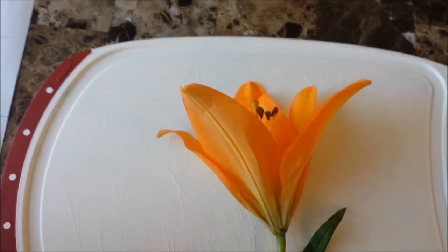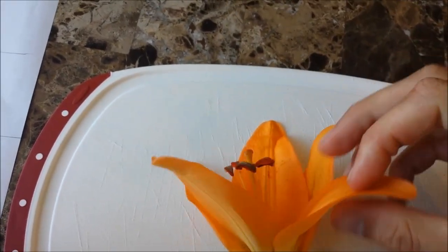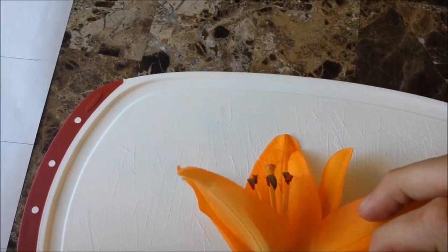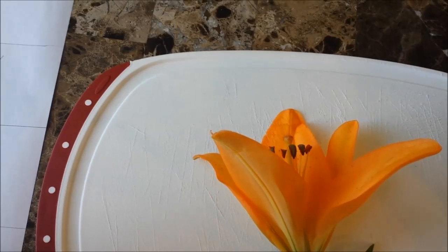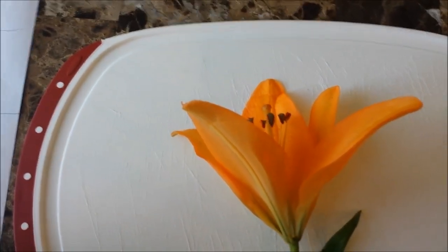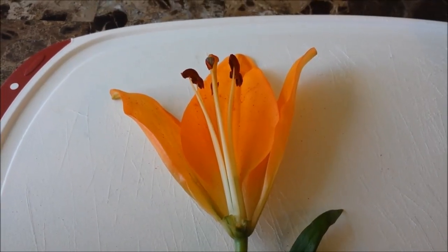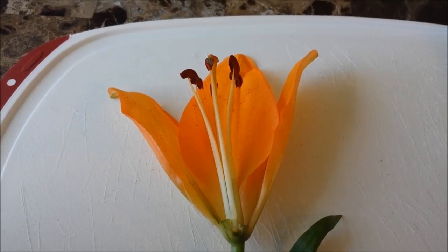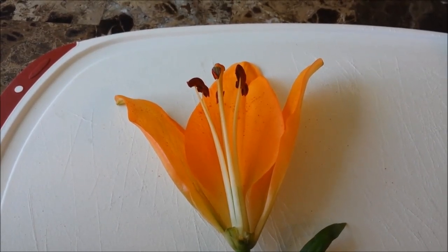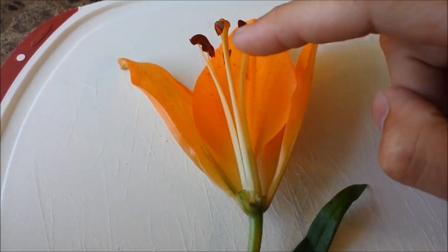Next we will be removing a petal, which, as I stated earlier, sometimes can look very similar to a sepal, but the petal is going to be right here if you were to look on the lily. On the lily, each of them come in multiples of 3, so 3 sepals, 3 petals. We'll go ahead and remove that right now. Now that we have the sepal and the petal removed, you can see the insides of the flower a little better. And next we will be removing the stamen, which are these right here.